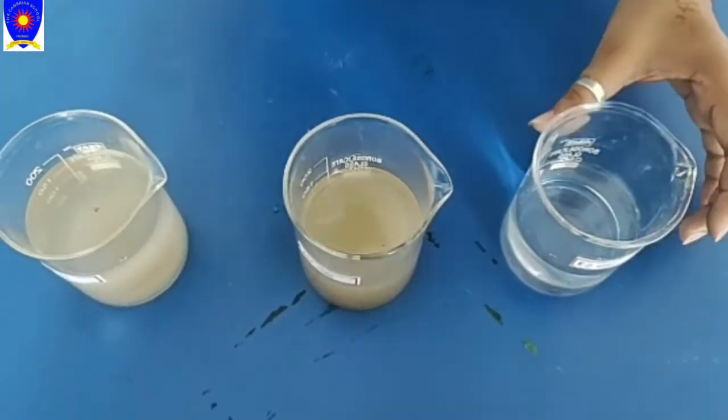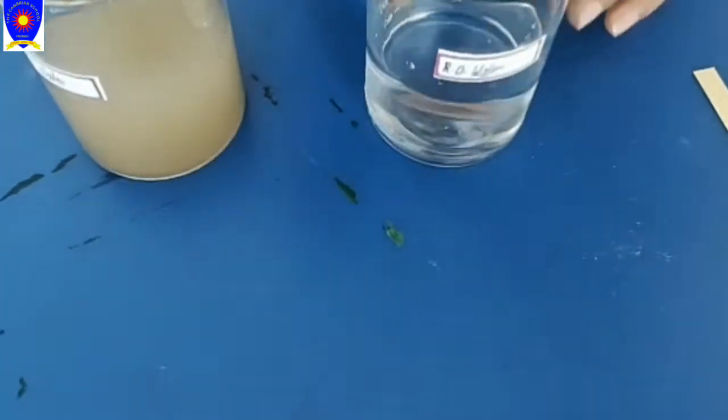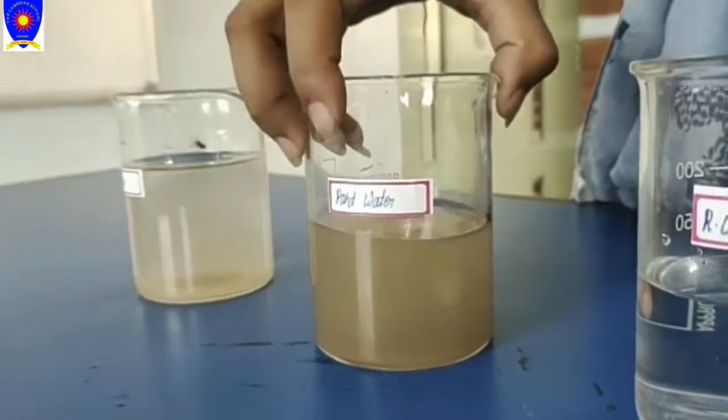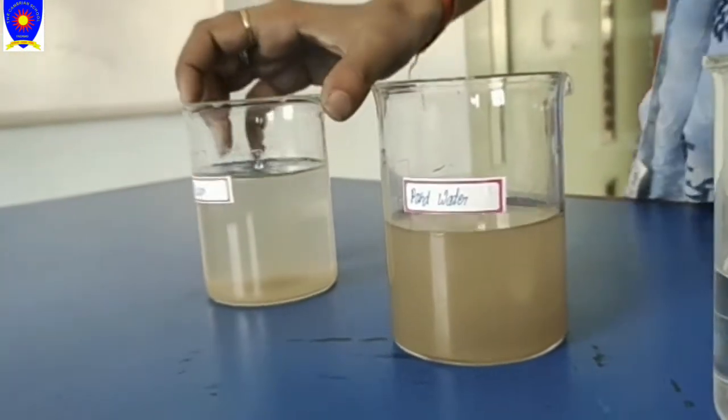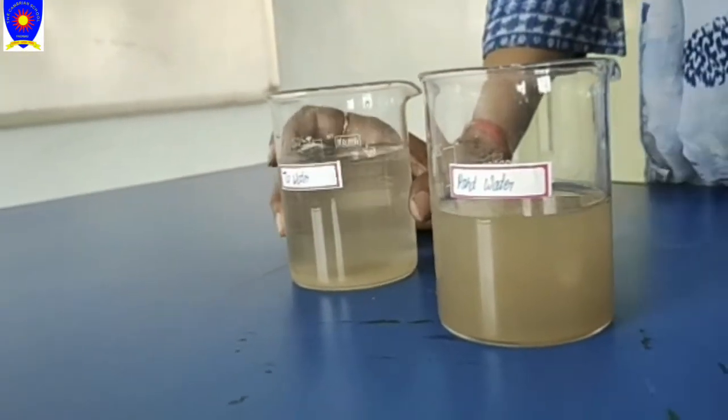So as you can see, the water sample we have taken is RO water, this one is the pond water, and the third sample is tap water.